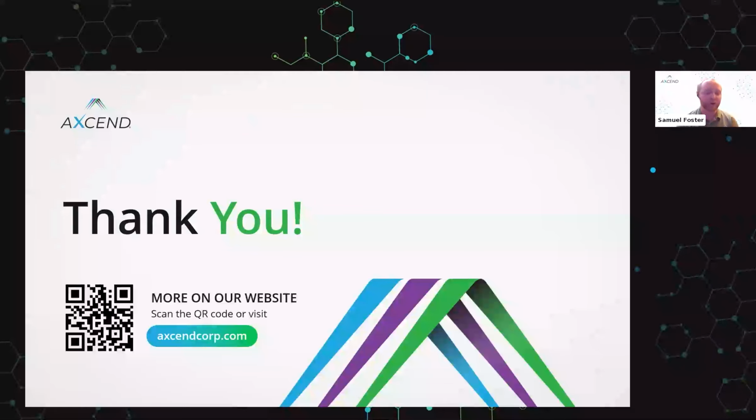So first and foremost, one of the best tips that I can give for avoiding clogs is filter solvents, filter samples. Anything that should be going through the system should be filtered. We recommend a 0.22 micron filter. That tends to get you very, very good filtering to avoid all of that. That being said, it is a balancing act.